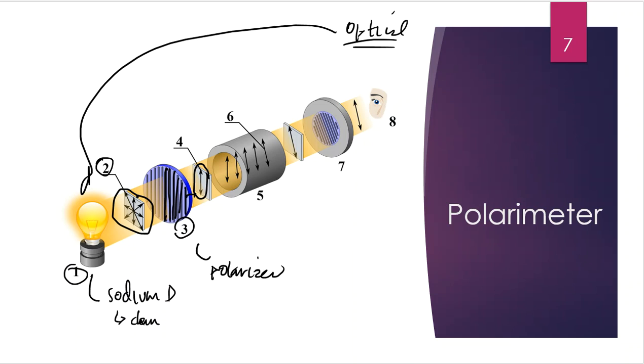At spot number 4, they're saying, listen, you now have polarized light. We're taking the light energy that's going in all different directions and streamlining it down into one orientation only. And in this diagram, it is up and down.